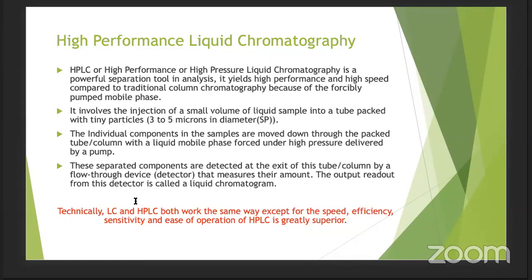If you also want to quantify it, then the technique that you will use is HPLC. HPLC is a type of liquid chromatography only, and it uses a liquid mobile phase.